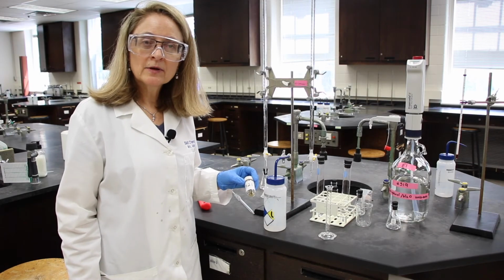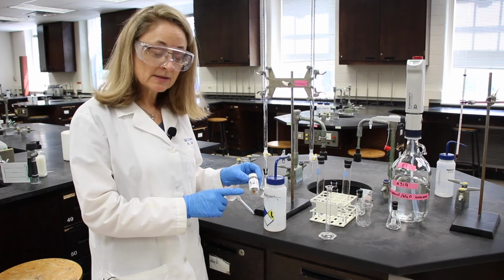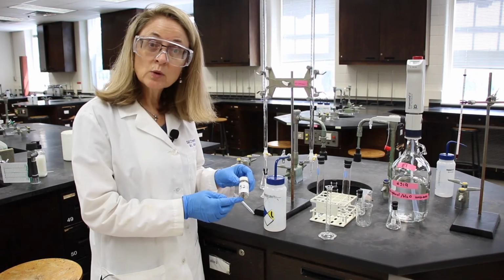In part 5, we'll determine the identity of a solid by calculating its density. First, we'll weigh the solid.